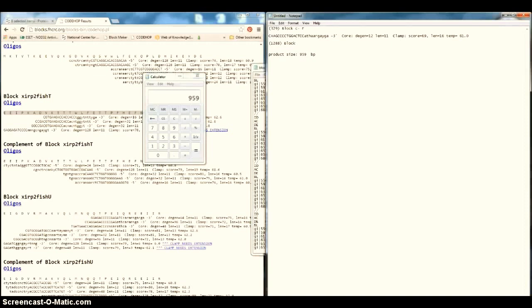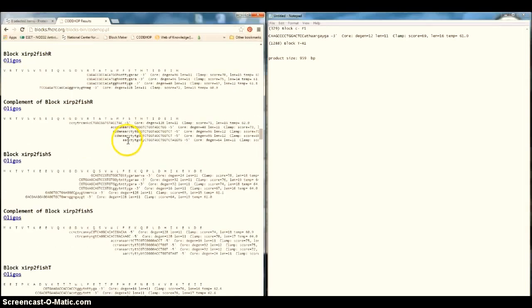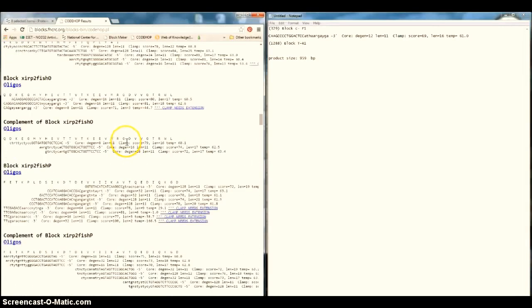Block T as a reverse. Write it down like this, because otherwise you can forget what you chose. So it can be forward one, reverse one, and forward one, because you can choose any primers here, and for each block you can choose all of them and try which one works well.